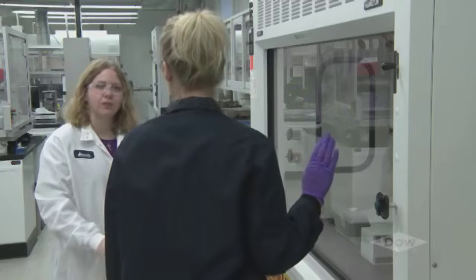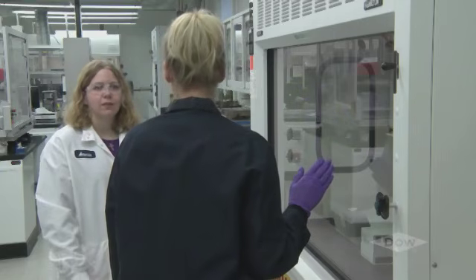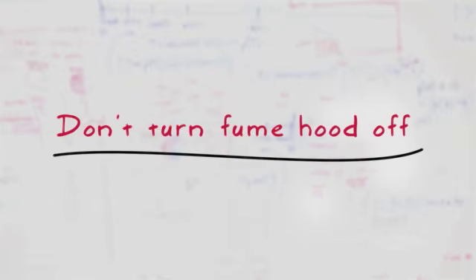Heather, stop! She was just about to turn the fume hood off. Never turn fume hoods off, even when not in use. This can impact the air balance in the lab. Labs are kept under negative pressure to ensure contaminated air doesn't flow out of the lab into other areas.